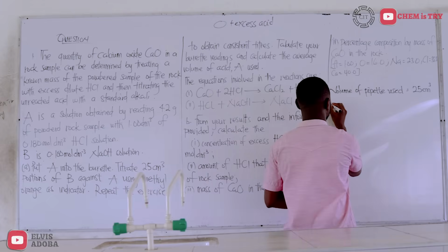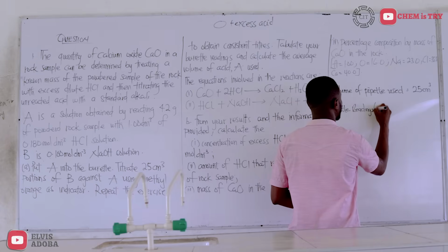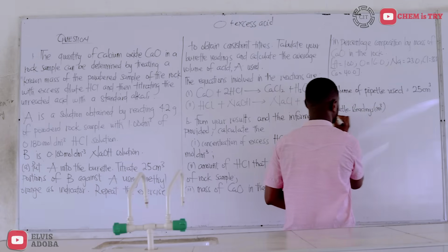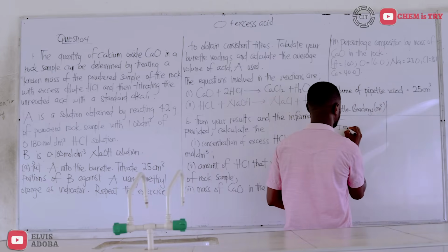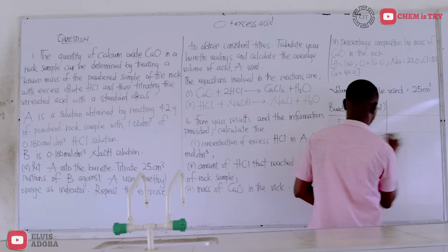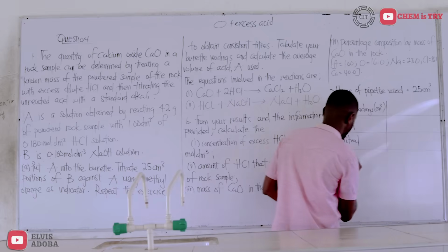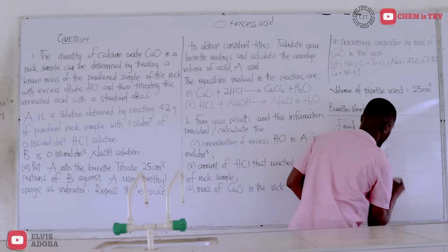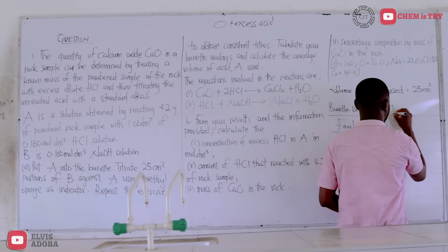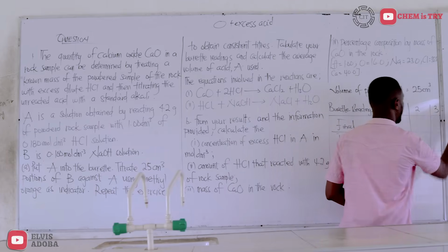Then you prepare your table. Burette readings in centimeters cube. We have the final, we have the initial, then we have the titer. And the experiment was conducted 1, 2, 3 times.